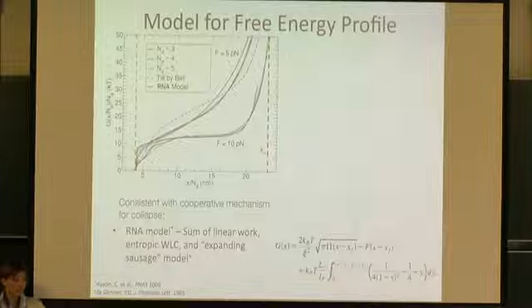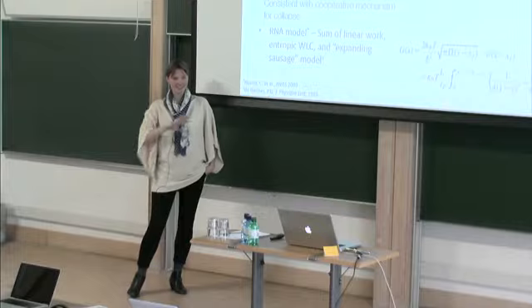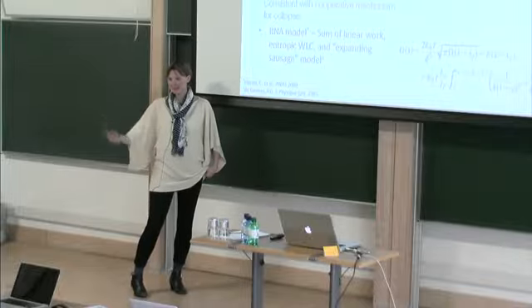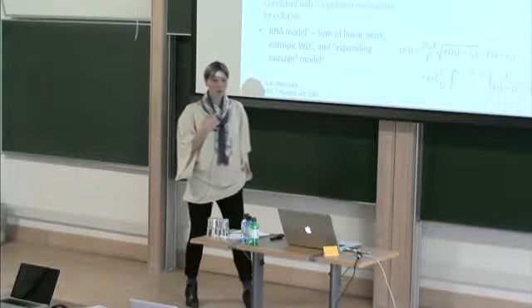How many of these collapse trajectories do you need? The remarkable thing is that you need like 15 trajectories, 10 to 20 trajectories, instead of, we thought we might need 1,000 or 10,000, and then all of this would go to waste, because it's 3 years of PhD to get 200 trajectories. So there's a kind of a grant problem with how well the estimator works. But it turned out that, with this assumption, with the simulations, you found that it was incredibly low, on the order of 10 trajectories.